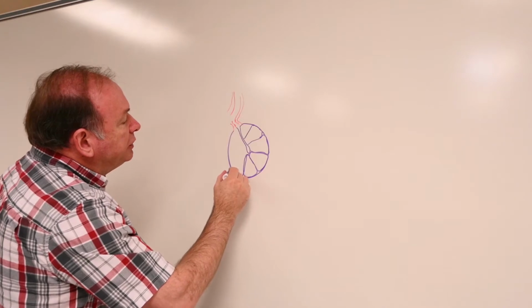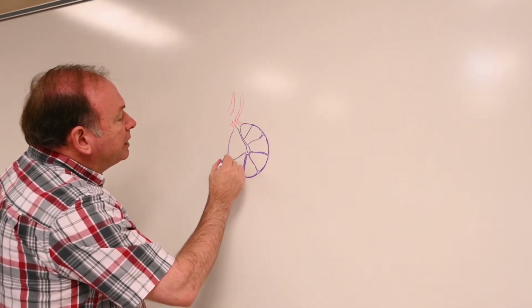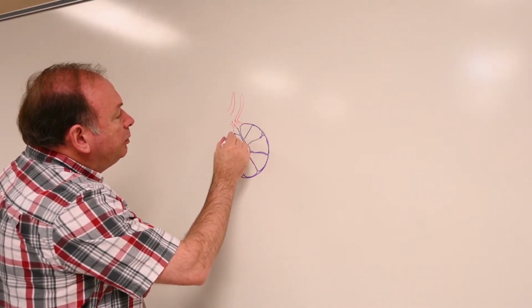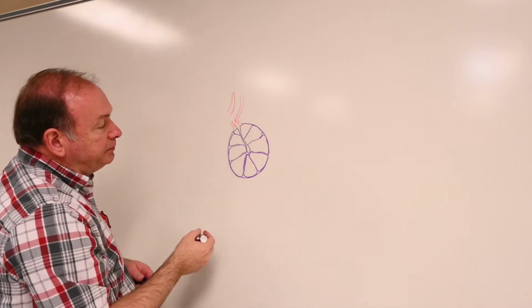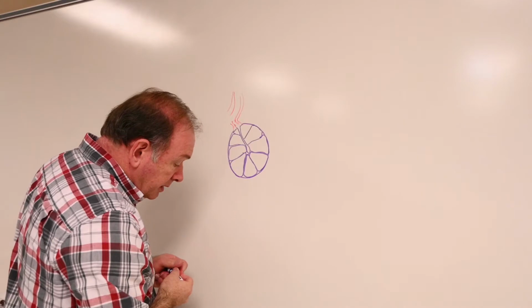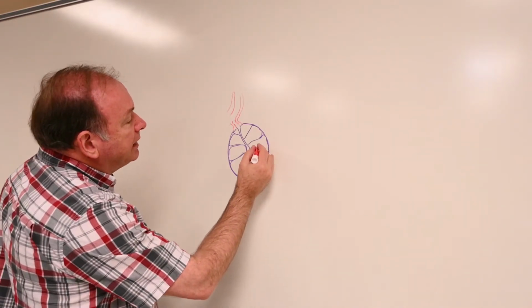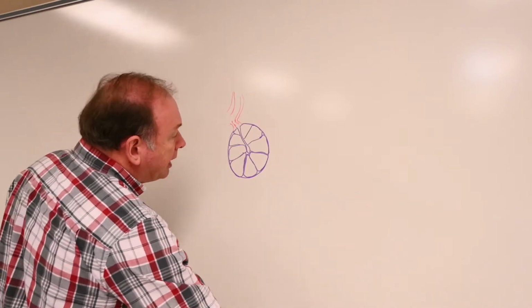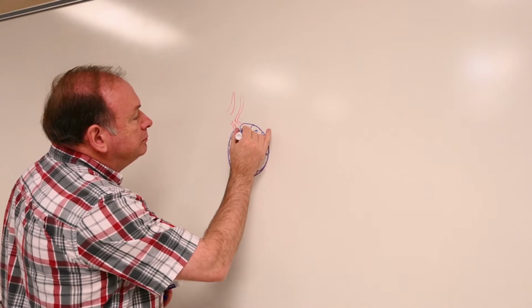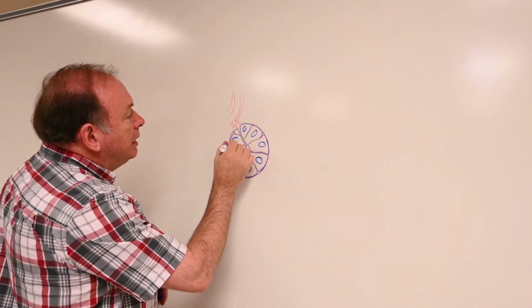It will remind you of the sweat gland, the typical eccrine sweat gland of your skin, maybe in its overall shape, but it has different cell types present. These cells usually have the nuclei located toward the base a little bit.